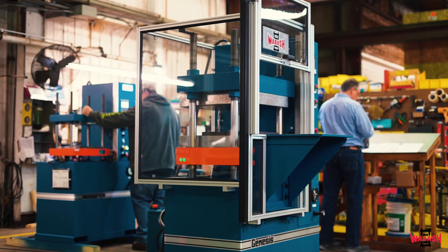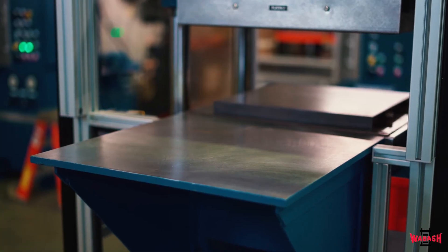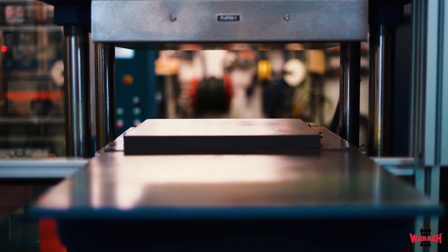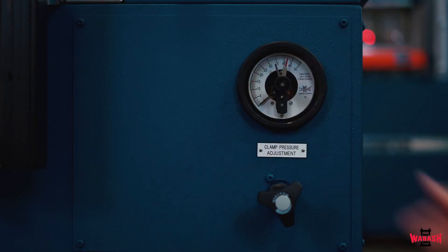This press is also equipped with several optional features. A work table on the front of the press allows the operator to pull their book mold out of the press between cycles for ease of loading and unloading. An optional contact gauge has also been installed on this press to allow the press motor to shut off after achieving the set clamp force on the press contact.